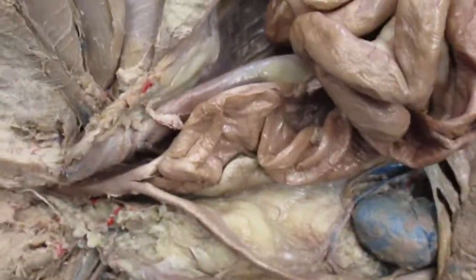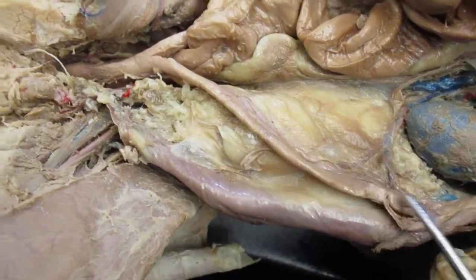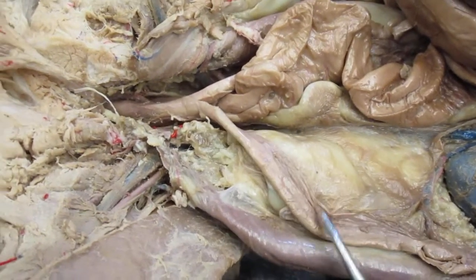Okay. Now for the female. I think I've showed you everything for the female, but real quick I'm going to show you again. So, we can see the ovary right here. You can see the uterine horn right here.